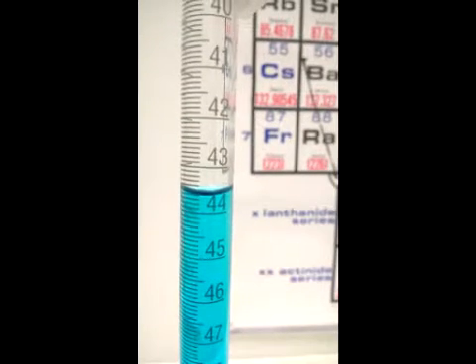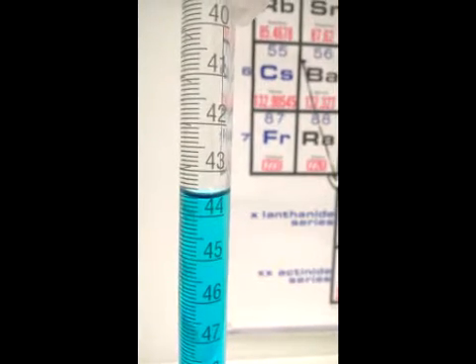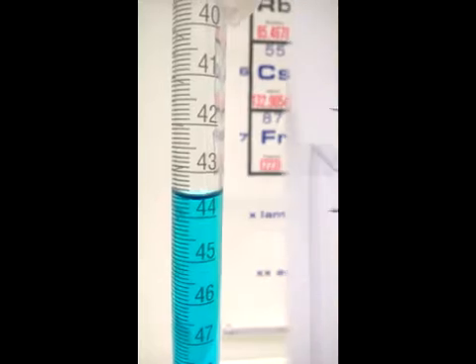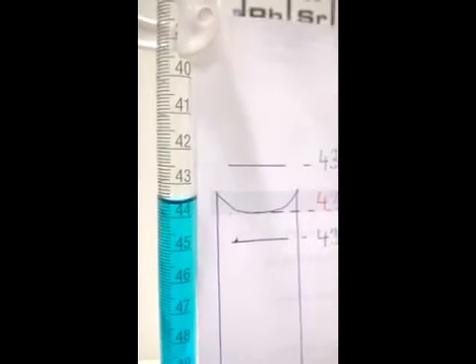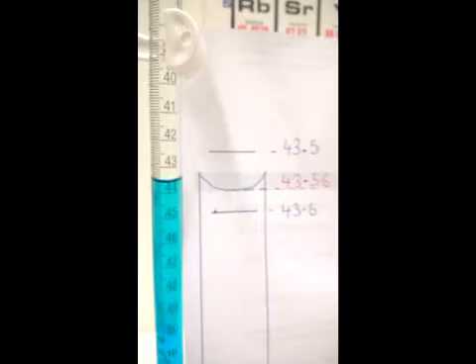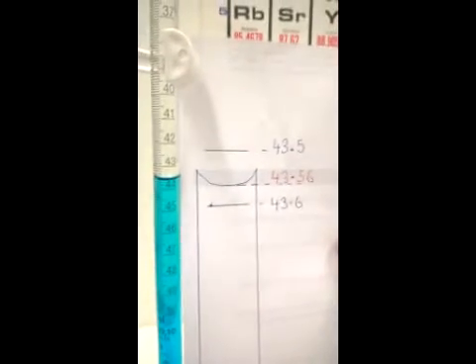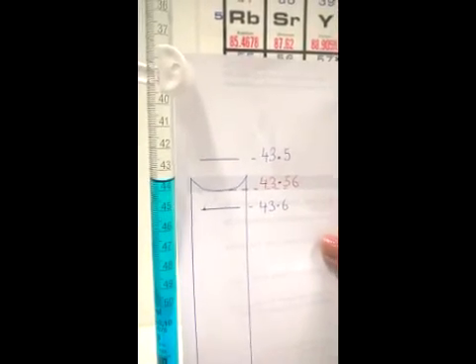Here, the top and bottom of the meniscus lies between 43.5 and 43.6 milliliters. Therefore, my estimation would be approximately 43.56 milliliters.